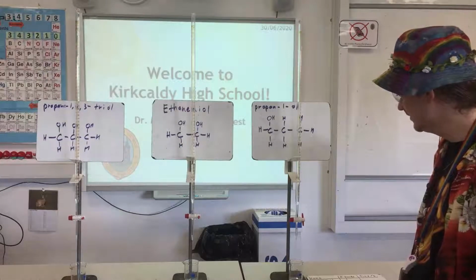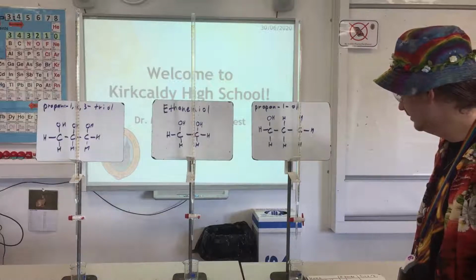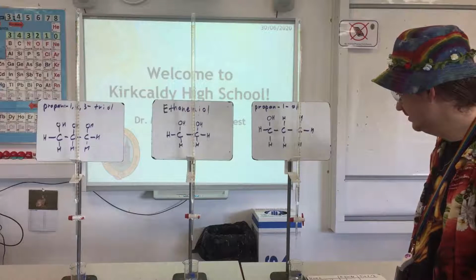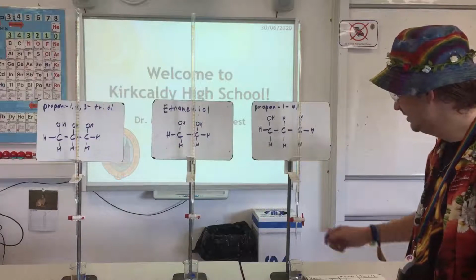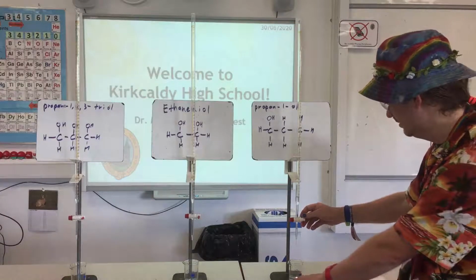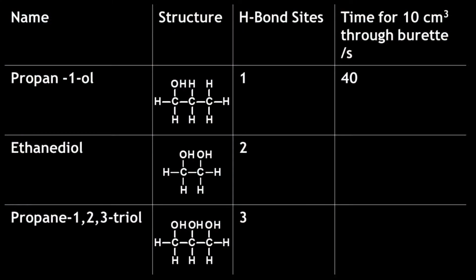43. 44. 45, 46, 47, 48, 49 cubic centimetres, and that's us at 50 right there. So that took just over 40 seconds. So I'm going to write that on my wee whiteboard here.